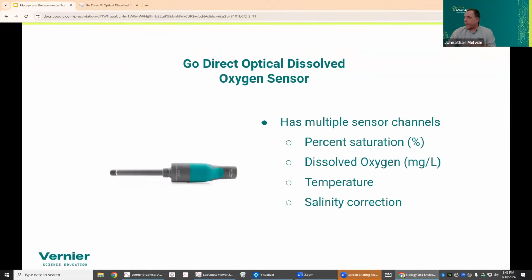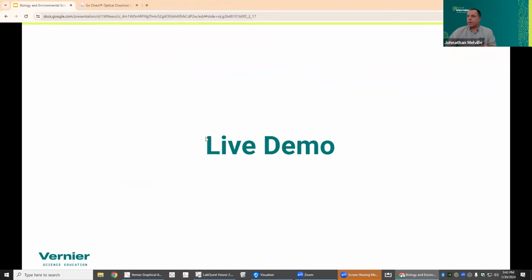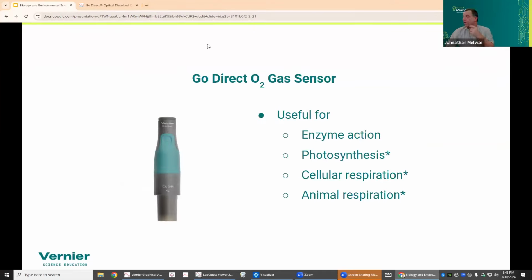I cannot review right now how to calibrate the go direct pH sensors, but I'll show you where you can. Because one of the great things that you can do is you can go to our YouTube channel and there's going to be videos there of how to do a lot of what I'm telling you what to do. It's a great resource. All right. So let's just talk really quick about the go direct O2 gas sensor. And once again, thank you for so many questions in chat. This is really terrific. I love how engaged you all are. So feel free to keep those coming.